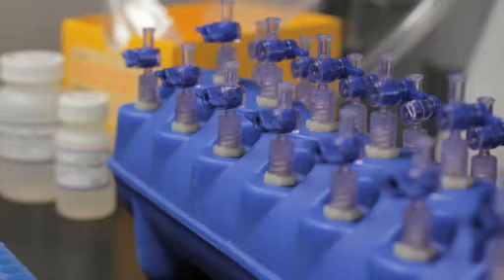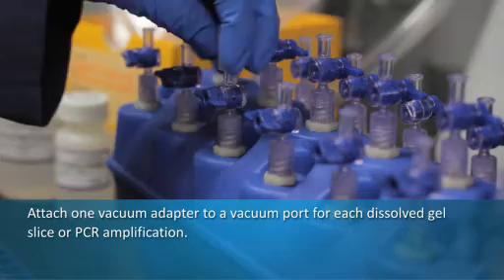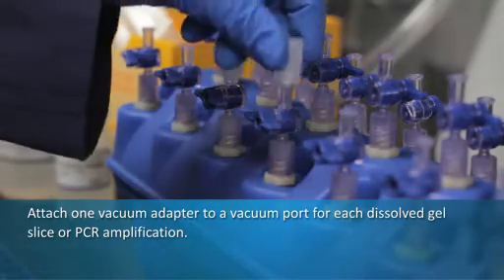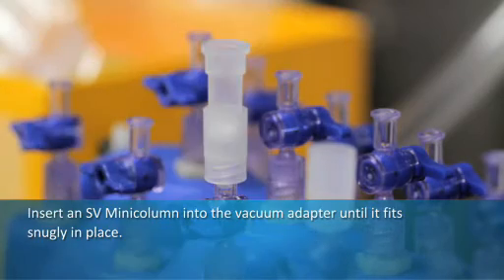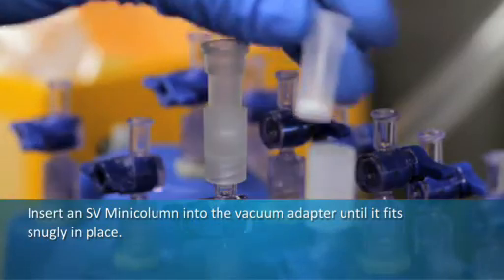Attach one vacuum adapter to a vacuum manifold port for each dissolved gel slice or PCR amplification. Insert an SV mini column into the vacuum adapter until it fits snugly in place.